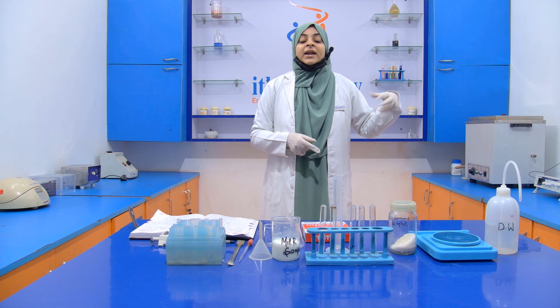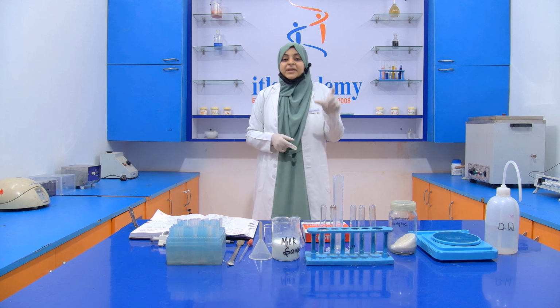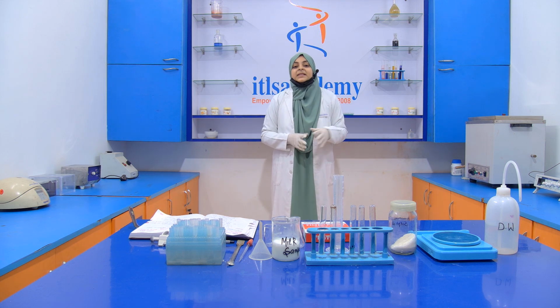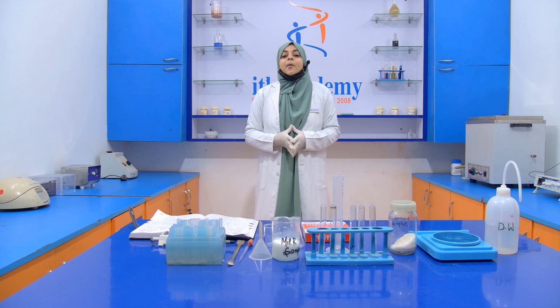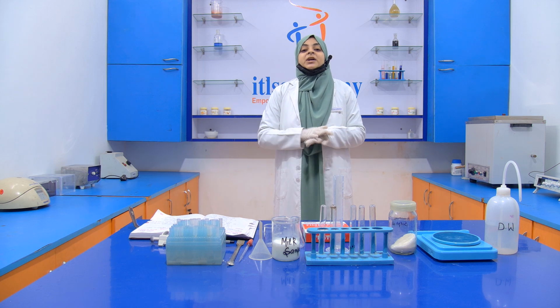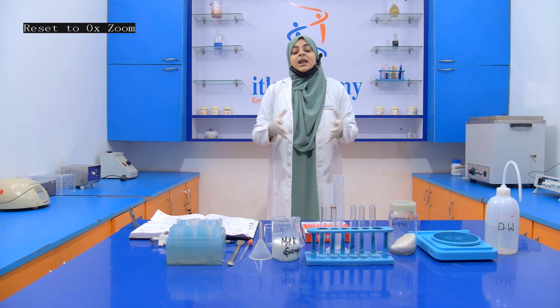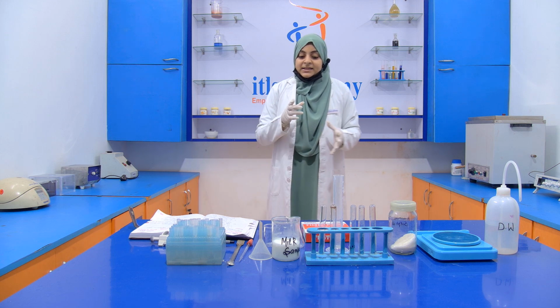When we remove it, if turbidity is present in that milk, then it means that the proper sterilization procedure did not occur. So this is a method for checking the efficiency of sterilization. So let's start the experiment.